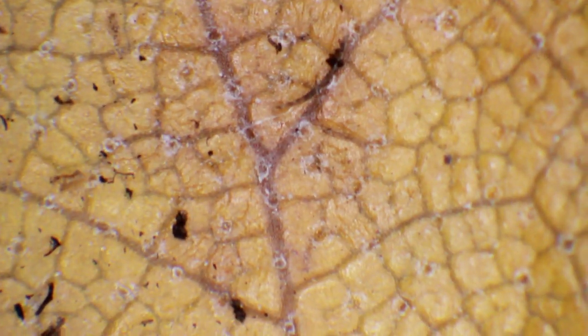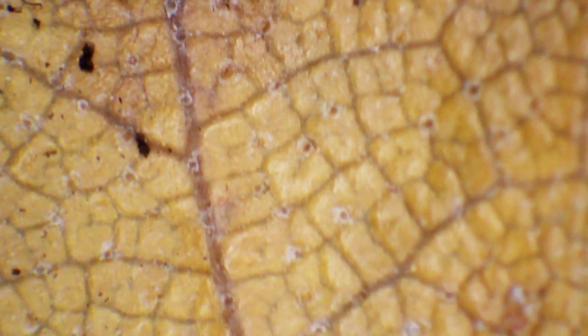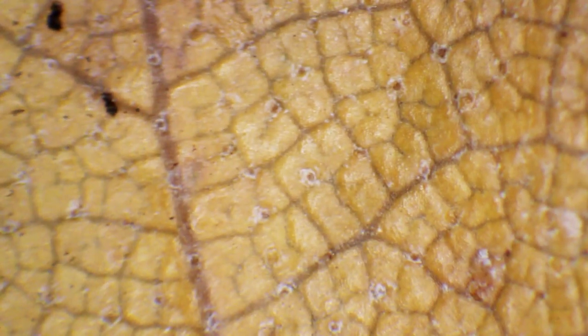A few days later, you can see there are some white spots on the birch leaf — I think this is where fungi start to increase their growth. You have to keep everything quite moist. I was a little bit surprised that I had to spray everything pretty much every day, even though I put a lid on the plastic container, because apparently it was not sealing off quite well.